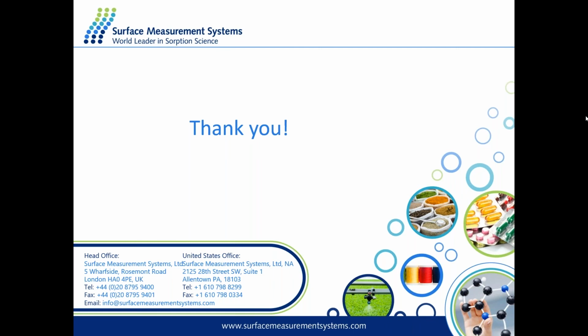Thank you. I can see we've got another question coming in. I can't tell if this question is for you, Edgar, or for Sebia, but whoever is able to answer it, I welcome you to have a go. It asks: if you have a wet coating process, how will it affect the adhesion and cohesion properties versus values measured of the dry materials?